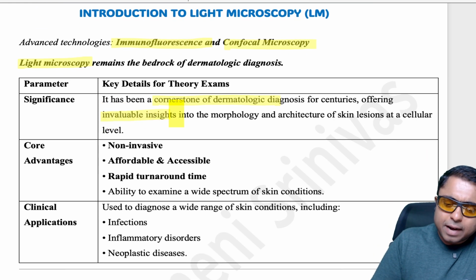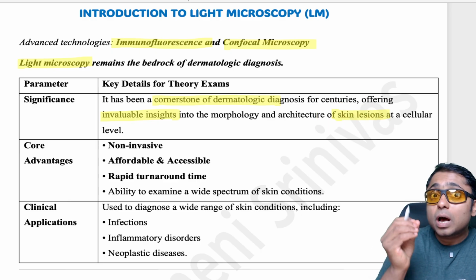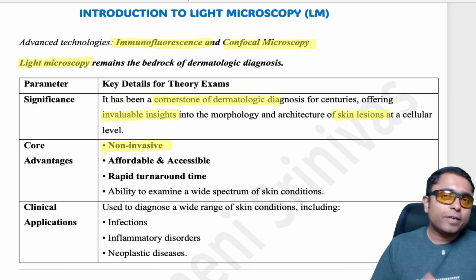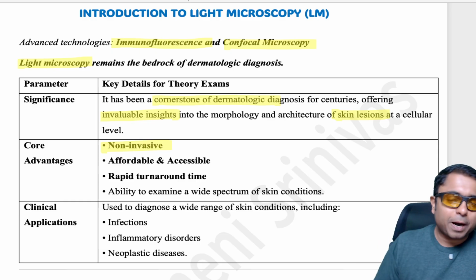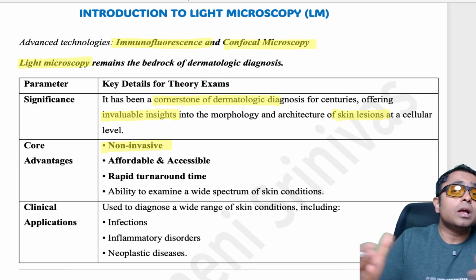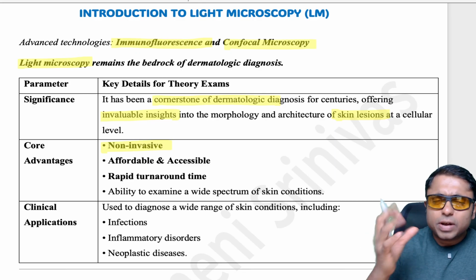It offers invaluable insights into the morphology and architecture of skin lesions at a cellular level, and it is very non-invasive. Apart from the pathology department, who use the microscope after taking a biopsy, which is an invasive procedure, in the dermatology OPD, if there is a microscope, you can definitely use it for so many other indications which are non-invasive.